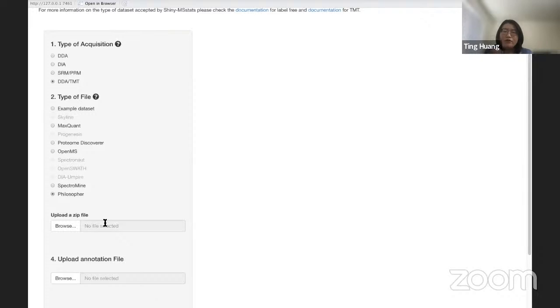For TMT, it may have multiple TMT mixtures. Just as you have seen in Olga's talk, we call it a TMT mixture. It's because some other people may also call it an experiment or even a batch. But what we really mean here, a mixture is a mix of all the samples labeled with different tags. You first label the samples with different TMT tags and mix them together as a single mixture, right? So then we call it a mixture.